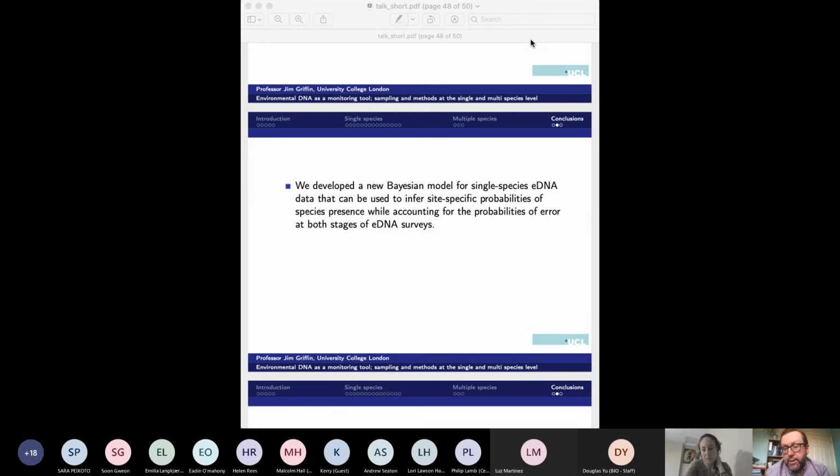Yeah, and I think there's lots of areas where people could use these types of ideas. That's related to Richard's question about the qPCR protocol for COVID-19, where, as far as we know, they collect a single swab from each individual and then run a single qPCR, which, as we know, even with our informative priors, you can't overcome that identifiability problem. There's no replication at either stage.